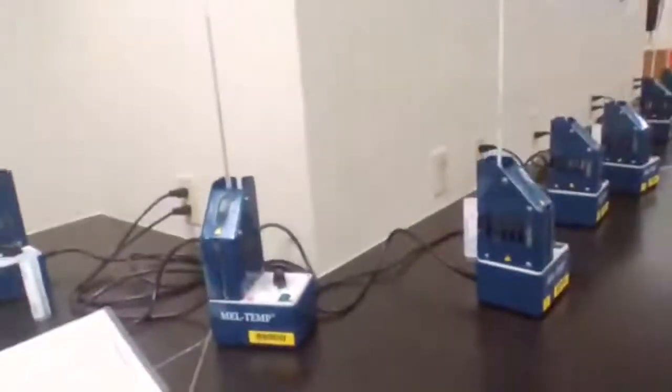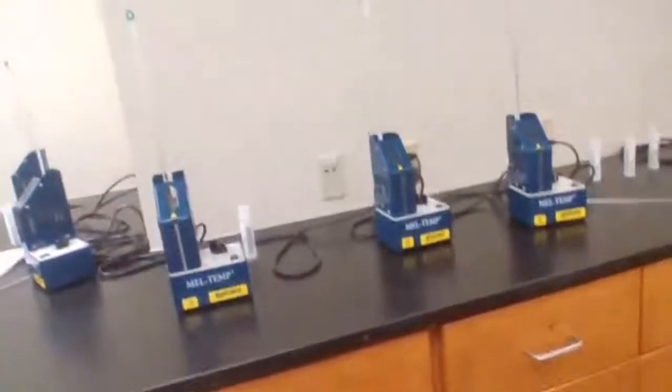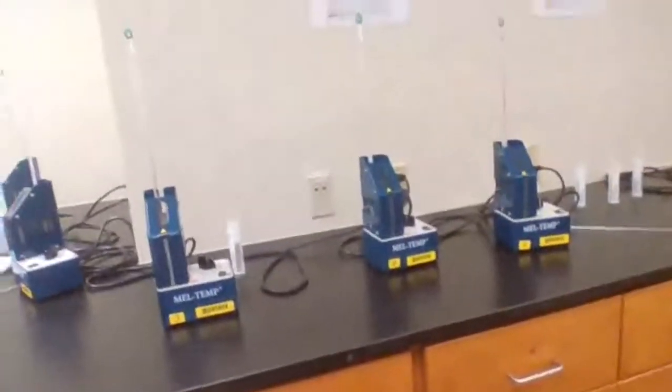Going to take the laptop to the instrument room and then get the sample for melting point. Here's the instrument room with the melt temp apparatus. I said we have them in the instrument room, those charts that are on the wall.